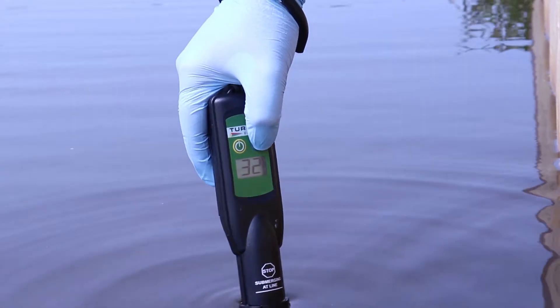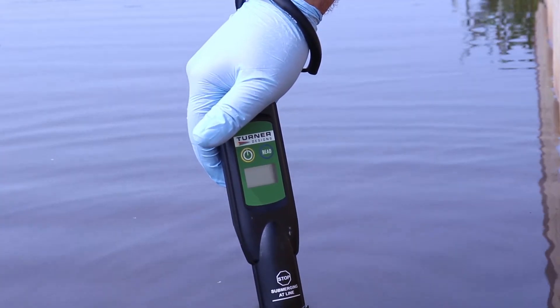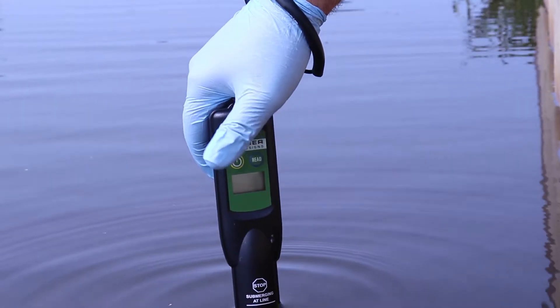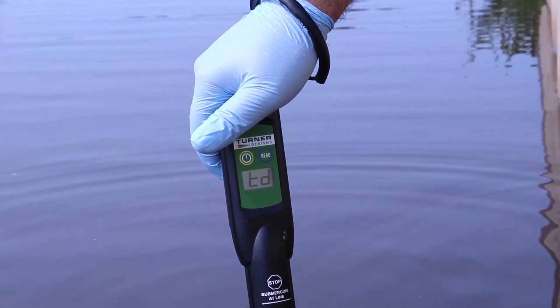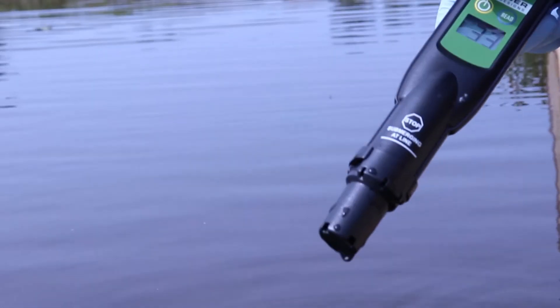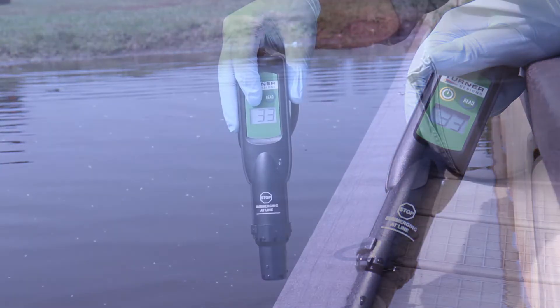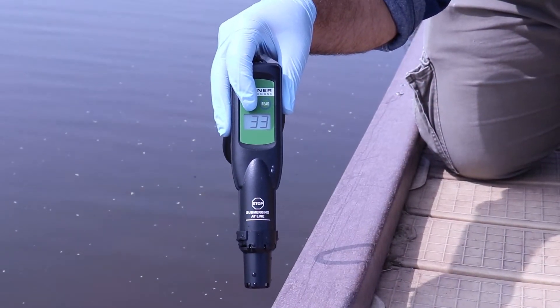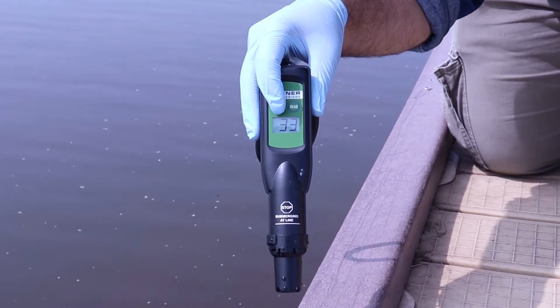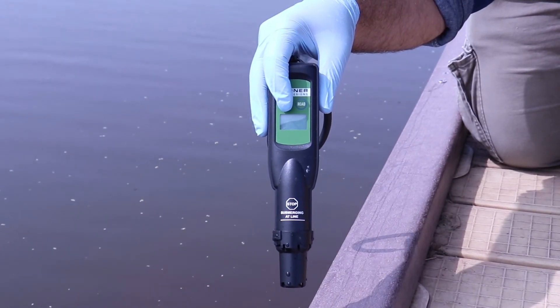Take three separate readings. The first reading was 32, the second reading was 33, and the third reading was 33. So the middle value, or median value, was 33 — that is the value you will be reporting. This result can be reported in the comments section of the Report-a-HAB survey discussed in part one, or in the phycocyanin field of the sampler form discussed in part three of this training series.